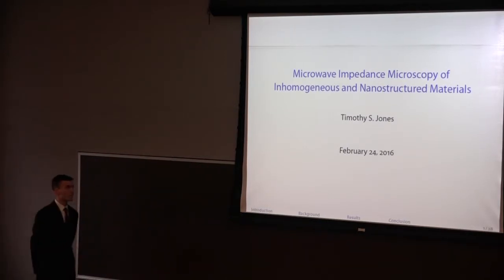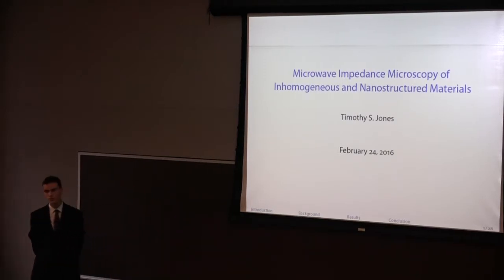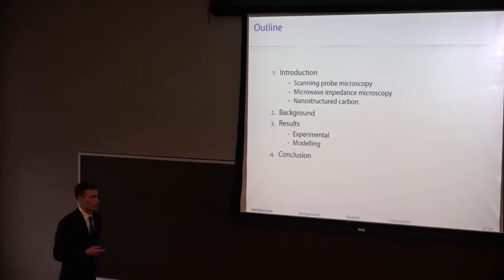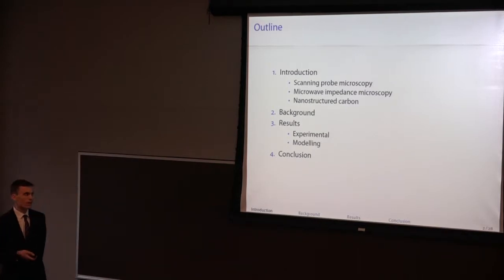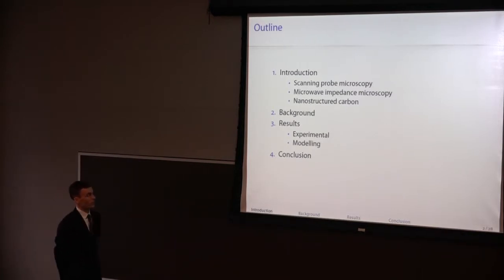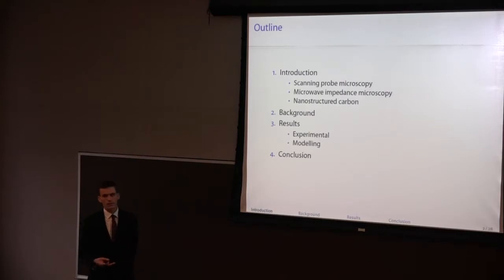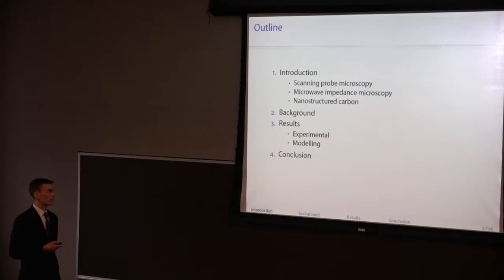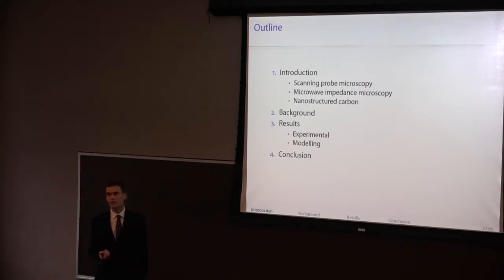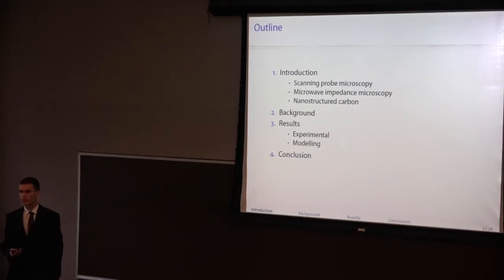Thanks. Yeah, so microwave impedance microscopy of inhomogeneous and nanostructured materials. The outline of the talk: I'm just going to introduce scanning probe microscopy for anyone out there who may be unfamiliar. Use that to kind of introduce the technique mentioned in the title, talk about the materials that I'll be using, then go over some of the basics of the technique and how and why I'll be doing what I'll be doing. Then discuss some of the preliminary experimental results I have, as well as more specifically my efforts to model and interpret those results.